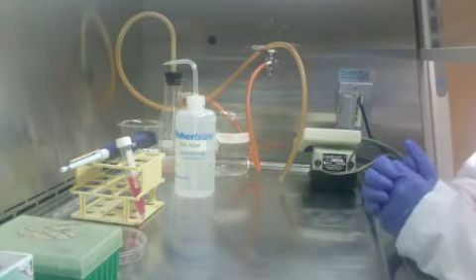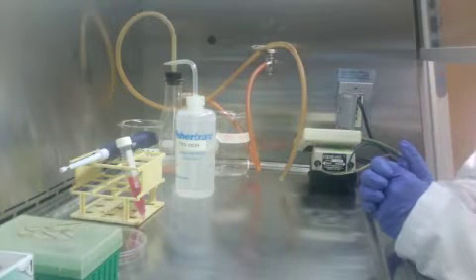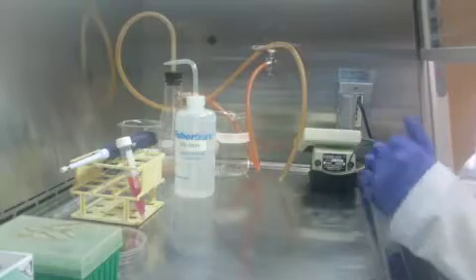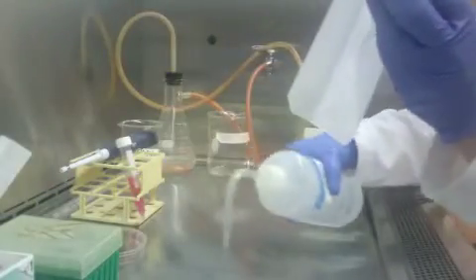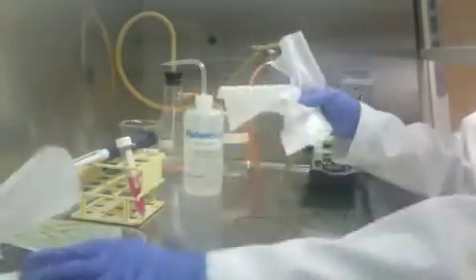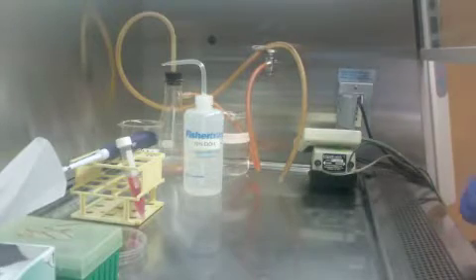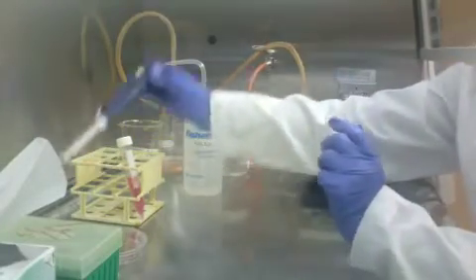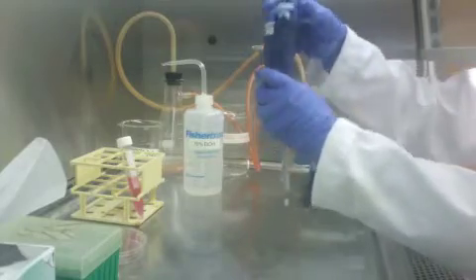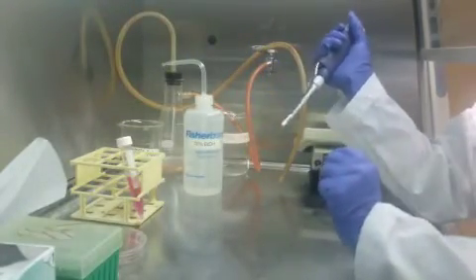After you determine the volume of the cell mixture to be used in the hanging drop media, you want to set up. Make sure to clean your area, change your pipetter to 27 microliters, and get comfortable because each lid holds 60 to 80 drops.